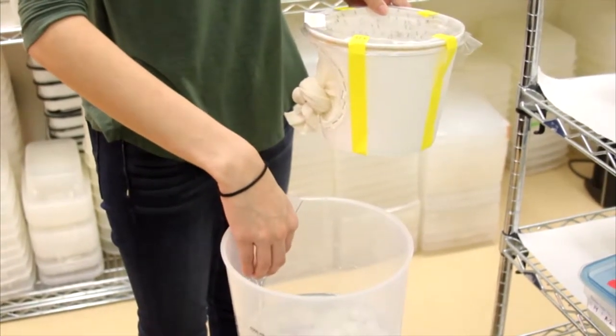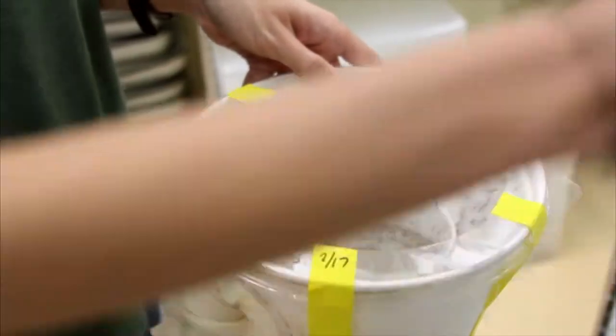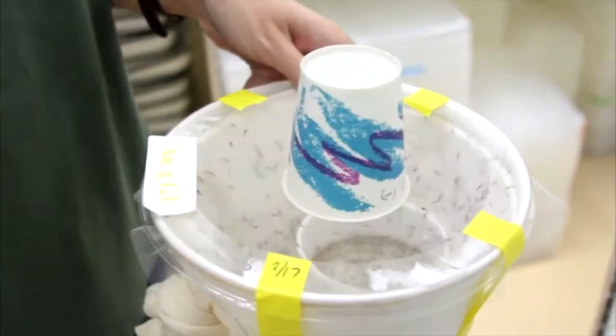Place a damp cotton ball with a 0.3 molar sugar water solution on top of the cage and cover the cotton ball with a cup to prevent it from drying out.